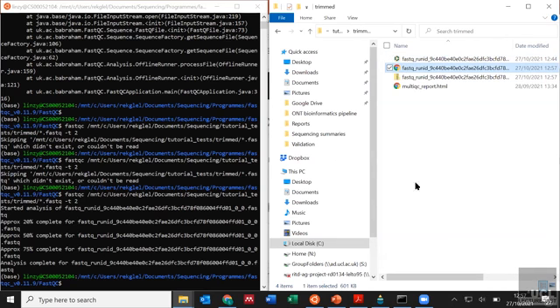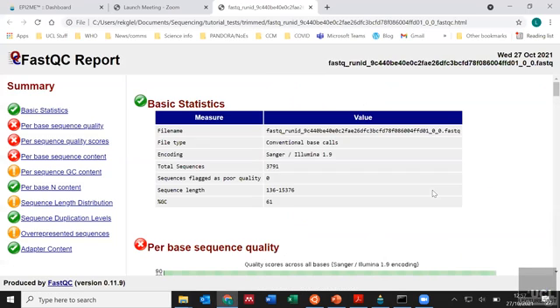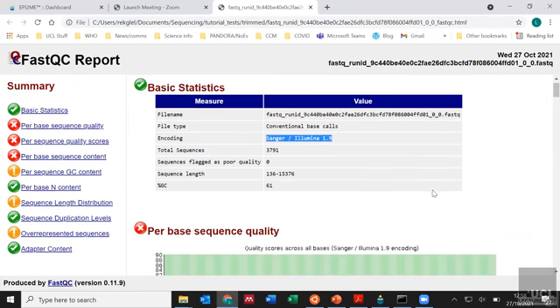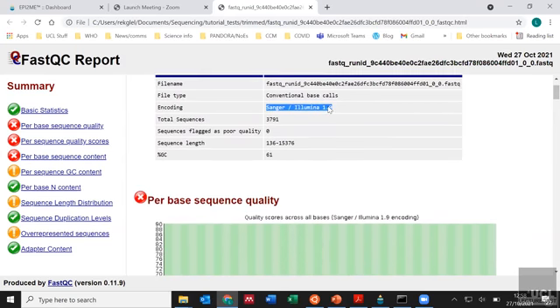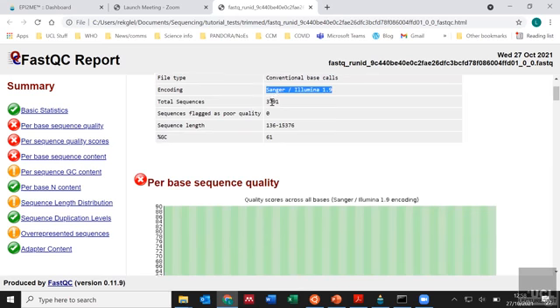As I say, it often says Sanger and Illumina, and I'm not sure whether there's anything we can do to change that. I did check, but the person who I asked all my questions about this thought that you just did it and hoped that it would work.